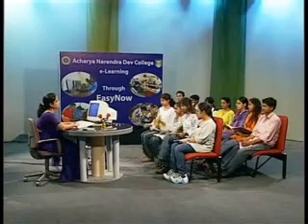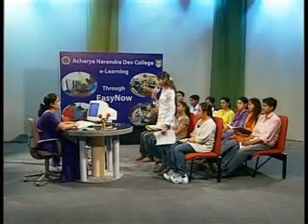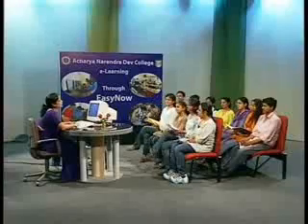Any other question? Why shouldn't we throw the sodium metal in the sink? We should not throw the sodium metal into the sink because sodium metal reacts with water exothermically. When the sodium metal comes in contact with the water, it catches fire and it may explode. So to avoid such accidents, we should never throw the sodium metal into the sink, and it should not come in contact with water.